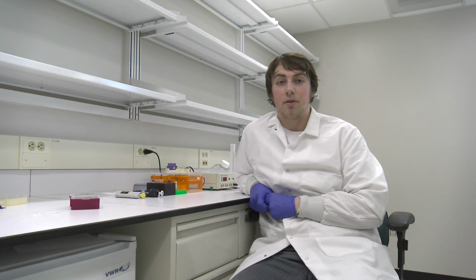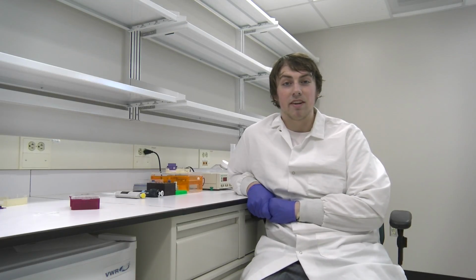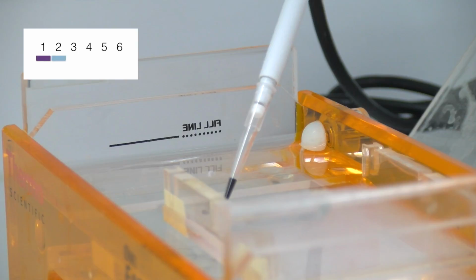Now that our gel is settled and our reactions are ready, we can start the gel electrophoresis process. To be able to interpret our results, we need the addition of a DNA ladder in our gel. This will definitively show us the length of each DNA band that is released. Depending on the concentration of your ladder, add 5 to 15 microliters of it into the leftmost reservoir in your gel. In the same fashion, add the rest of your samples to the subsequent reservoirs.